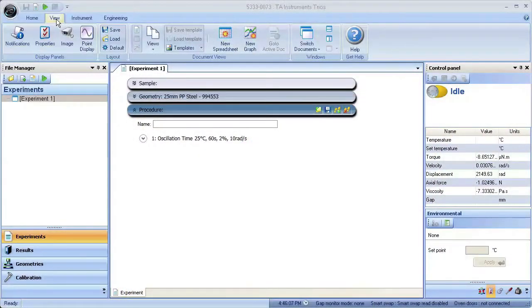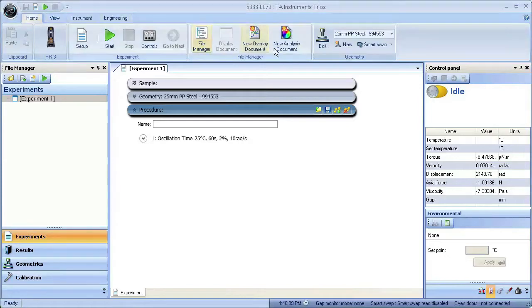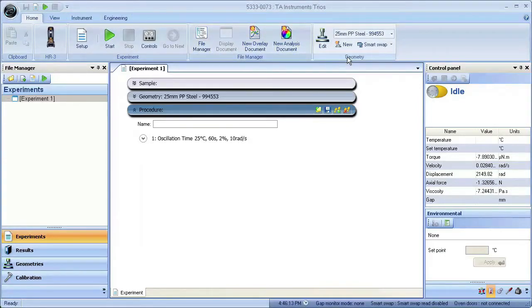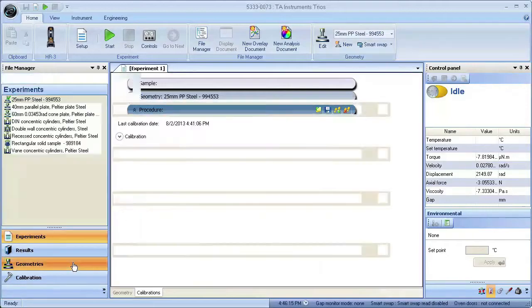Now that the geometry is loaded, go to TRIO's Home tab and verify the correct geometry is active. Then go to the Geometry Settings window and click on the Calibrations tab.